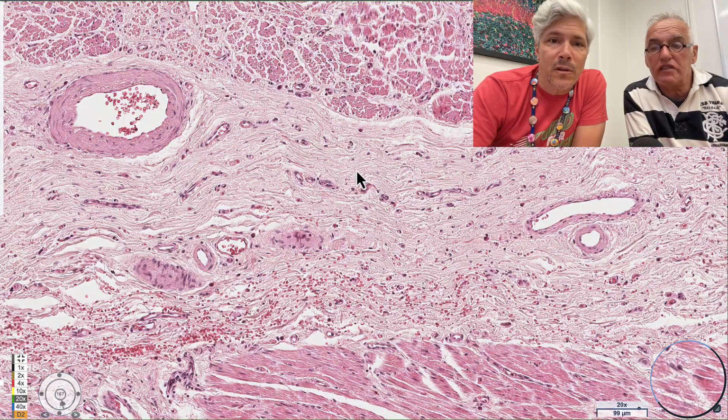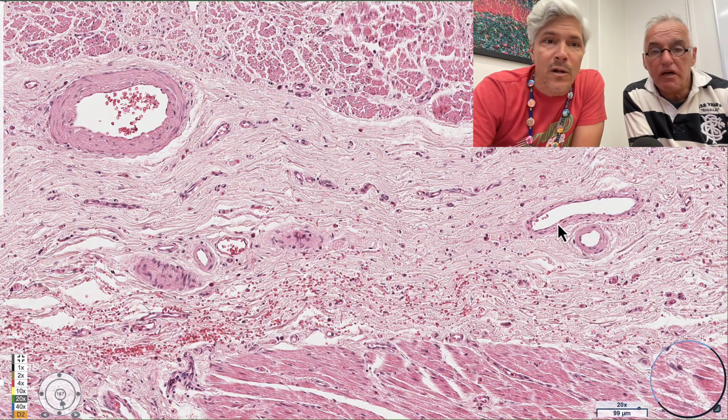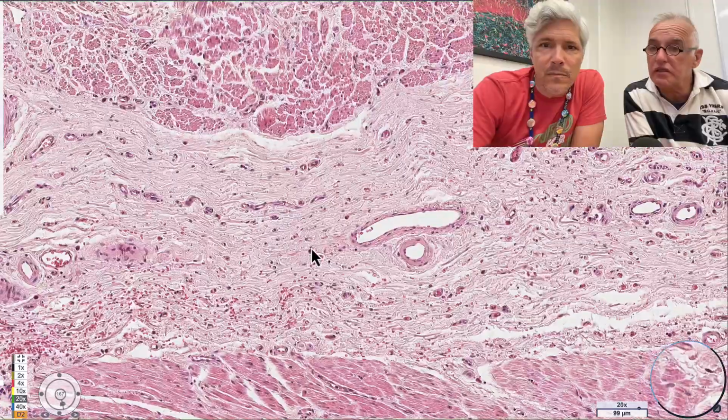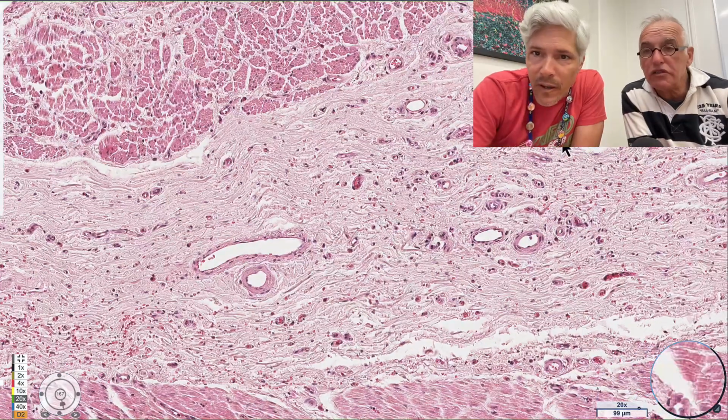A lot of connective tissue, a lot of collagen fibers. Just collagen streaming back and forth here with larger blood vessels coursing through as well. And you're going to find the nuclei of autonomic nervous system nerves in there sometimes. That might be a difficult spot, but it is possible to find them. They should be there.